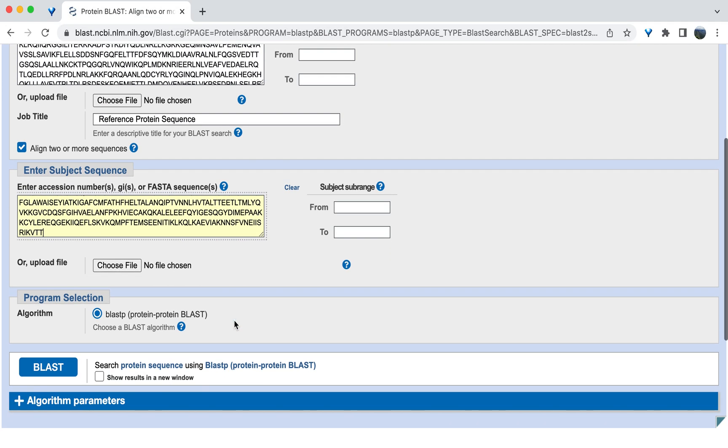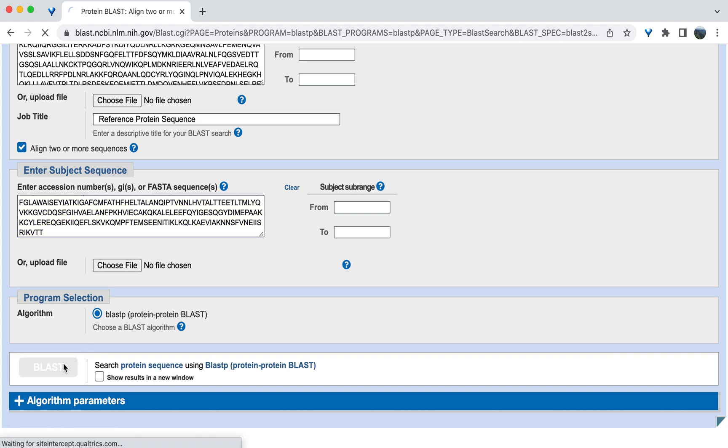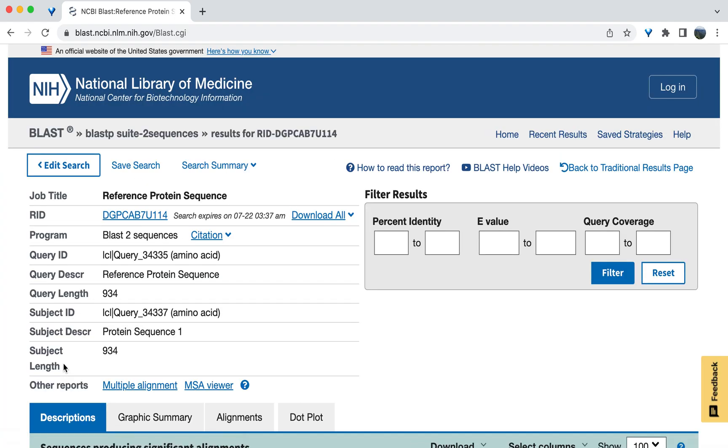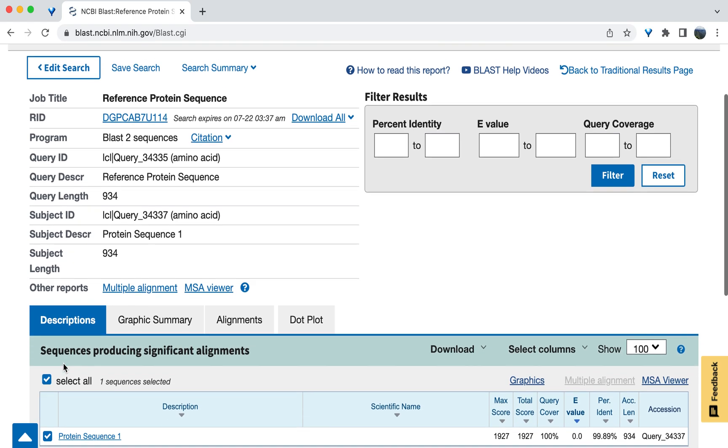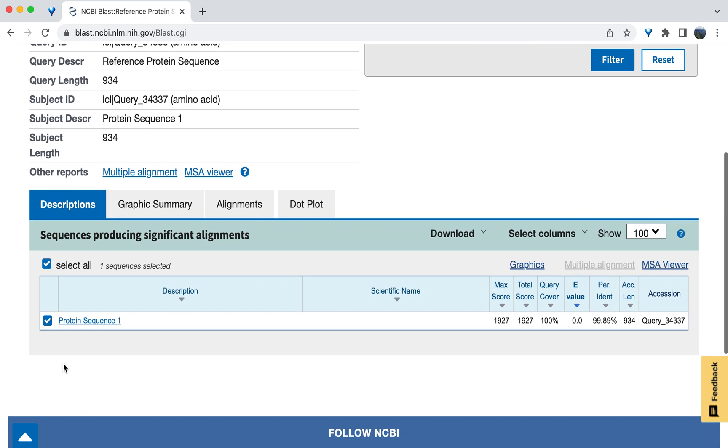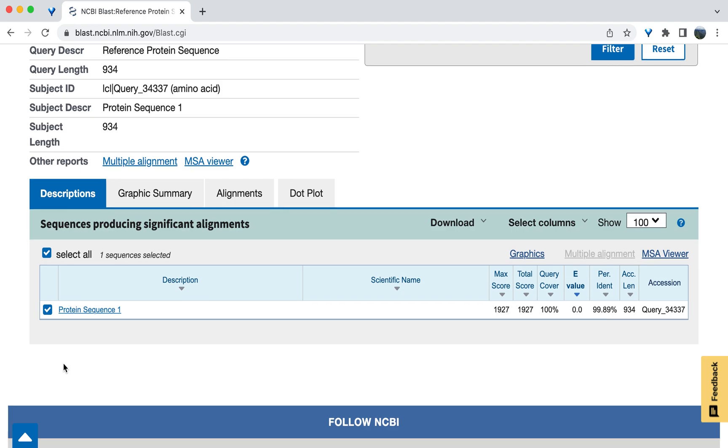Leave all the other settings the same and then hit the blast button. The page will refresh with the results, including the sequence alignments. Once this happens, scroll down to the table and look at the descriptions tab to see various aspects of the alignment.